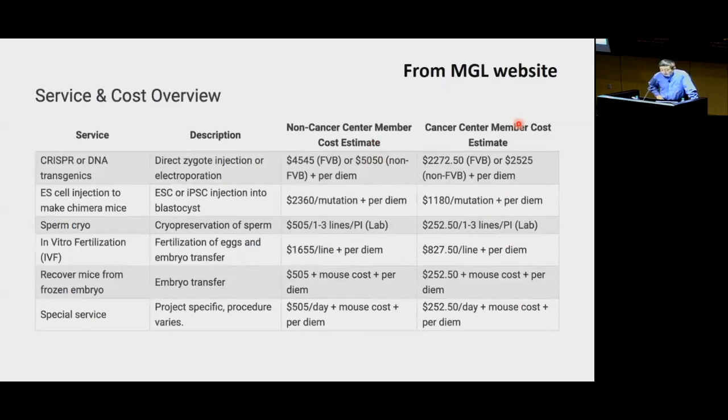But for the large fragment, let's say 4 kb knockout and knock-in at ROSA 26, we tried several. That usually we do by the so-called TILD approach. That's basically double-strand DNA with only homologous arm at both ends, no plasmid backbone. We have some success, but also we have cases that did not work.